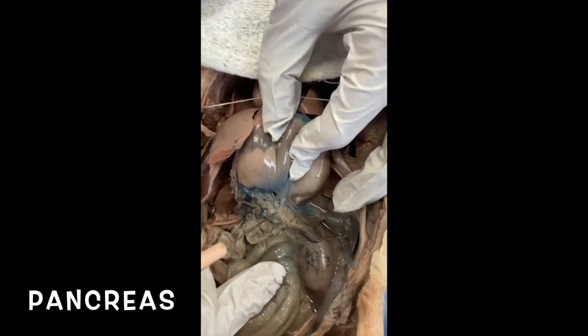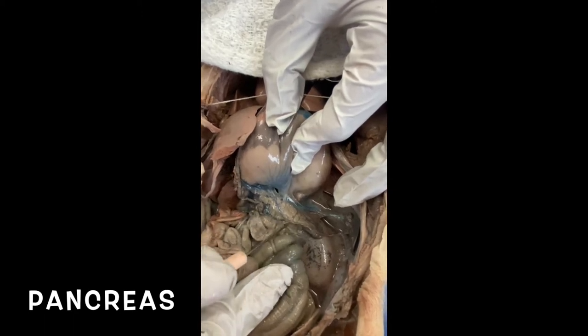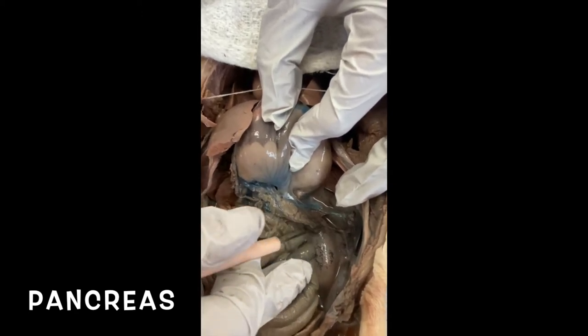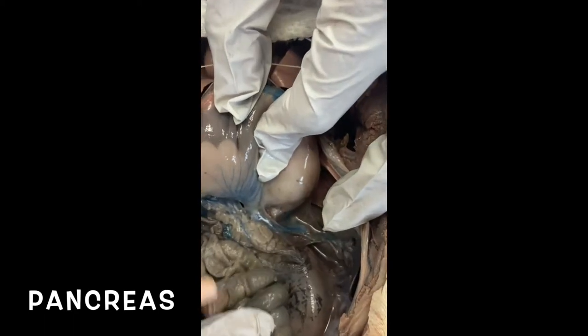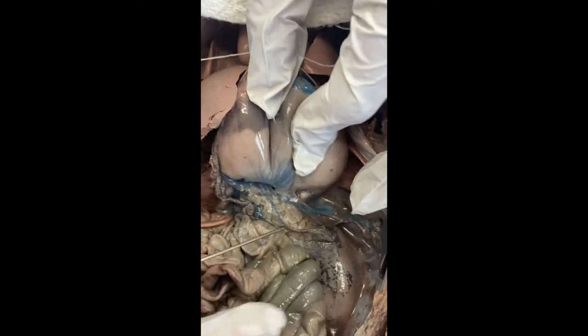It is underneath the stomach, and so it kind of starts here. There's the outline. Here's the tail of it. It's this little spongy organ right here, and I'm pulling it back a little bit. It looks more white in color, I would say.